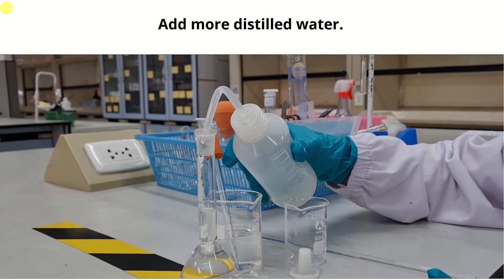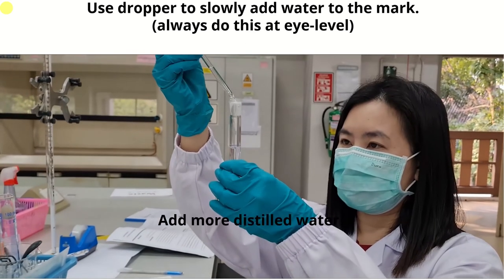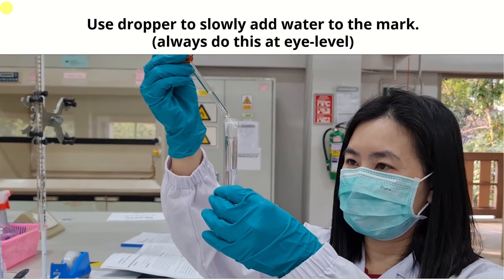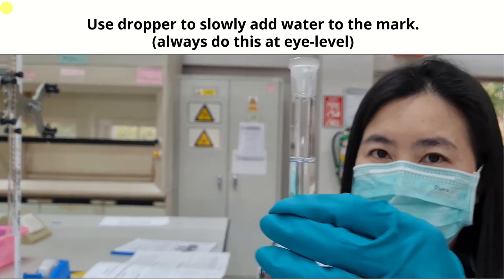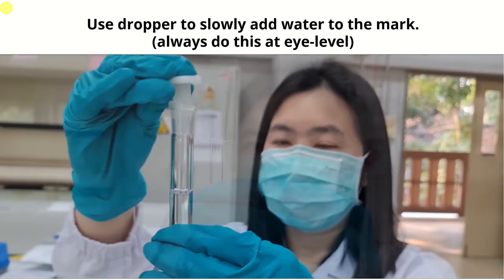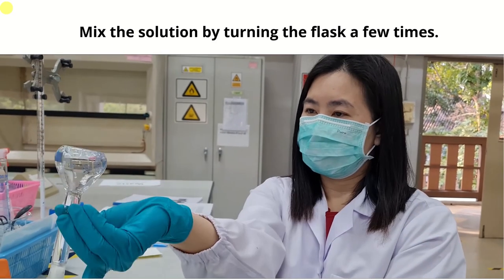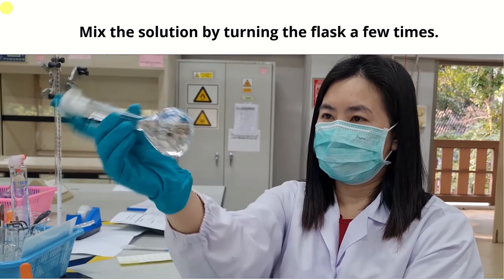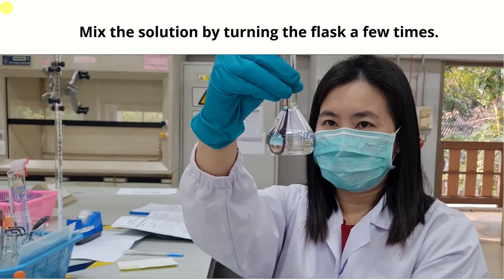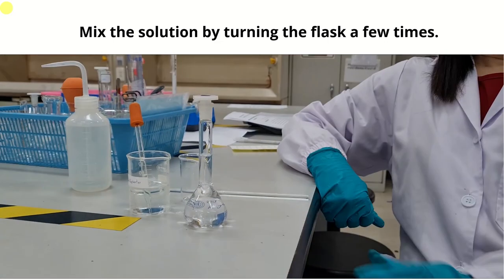Then add more water to the mark. Stop before the mark. Bring it up to eye level. Use the dropper to help you. Slowly adding water so that the bottom of the liquid touch the mark, and then mix it thoroughly by turning it upside down a few times. Okay, your KHP solution is prepared.